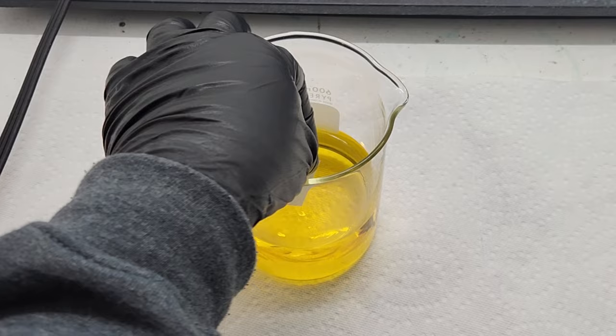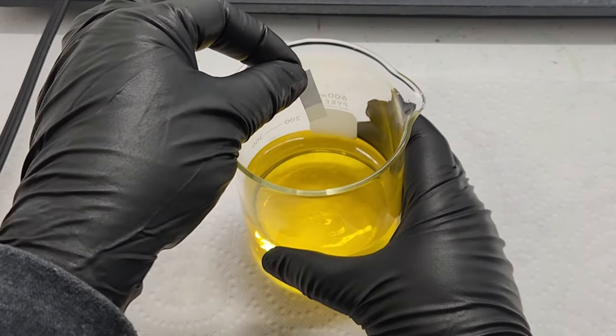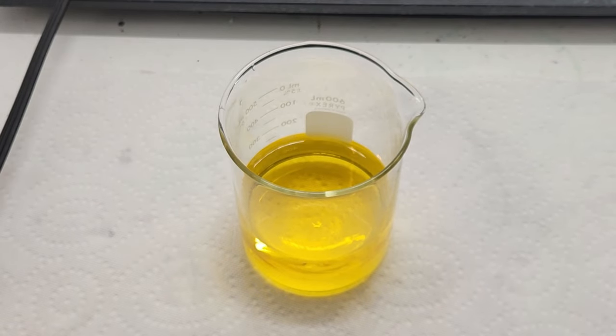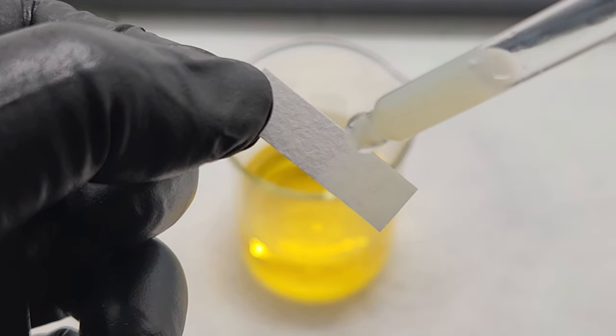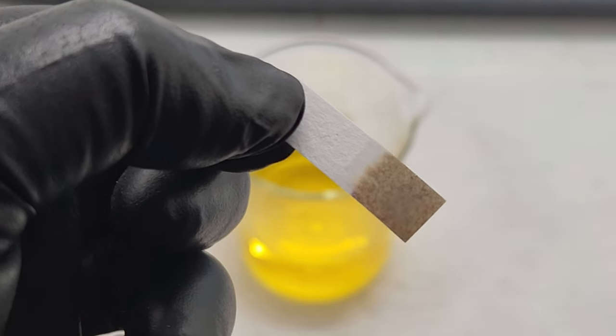Then we perform a stannous chloride test. A dark stain confirms the presence of gold in solution and, most importantly, the proper functionality of our stannous chloride testing solution. A dysfunctional stannous chloride testing solution gives the false impression of complete gold precipitation in the precipitation stage.